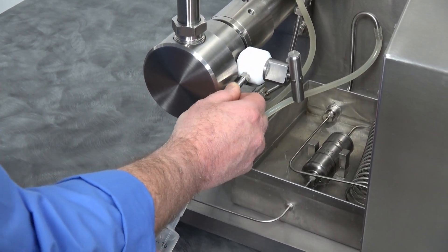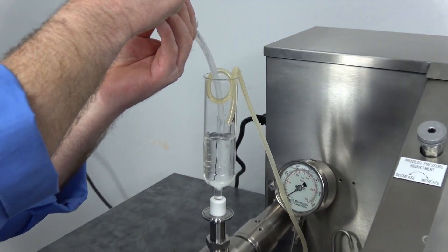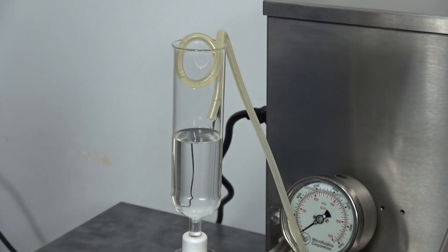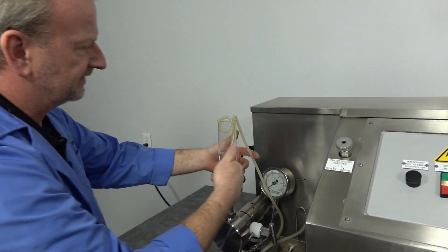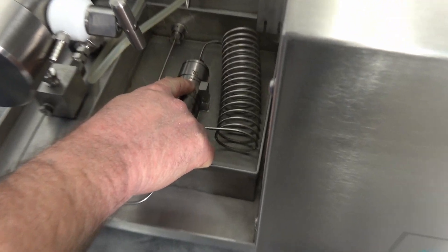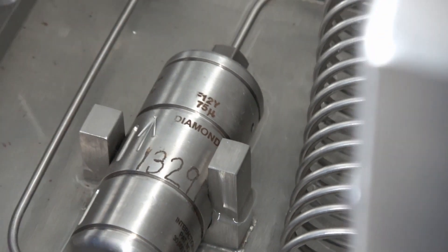I'm using alcohol for this demonstration. Right now I have the return hose hooked in back here and I'm just recycling it back into the glass reservoir. This particular model comes with a diamond interaction chamber — which is the upgrade from the ceramic — and it's got the 75 micron. You need a lot of pressure for 75 micron, so we've got this unit set pretty high right now.